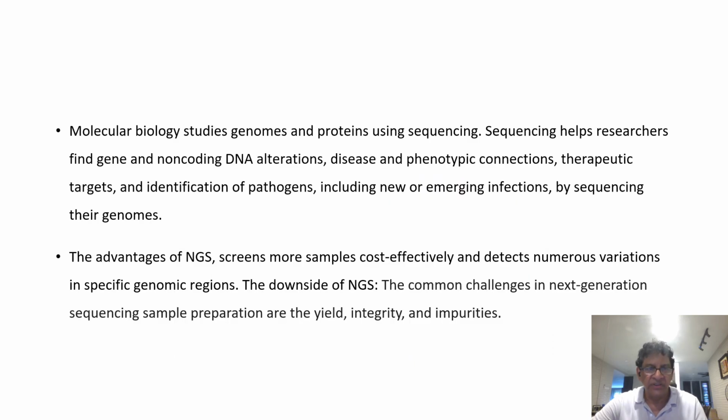In next generation sequencing, the molecular biology studies the genome and the protein sequencing. The sequencing helps researchers to find genes and non-coding DNA alterations, diseases, and phenotypic connections, and therapeutic targets, and identify pathogens, including new and emerging infections, by sequencing the genome. The advantage of next generation sequencing is that it can screen more samples cost-effectively and detect numerous variations in specific genomic regions. But the downside is that common challenges in next generation sequencing are basically the yield, the integrity, and the impurities.